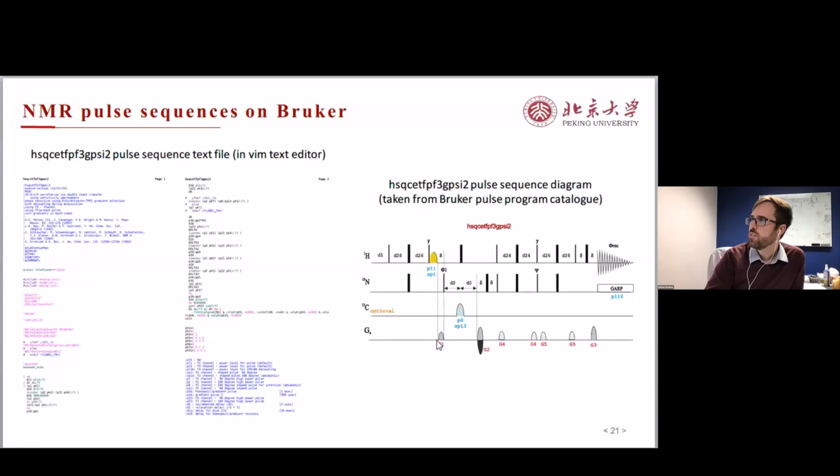All right, and then Barbara saying, many thanks for the nice overview. Little comment: the syntax is changing with the electronics and software versions. The Pulse program manual shown here is a bit outdated. For example, the SPF notation is now deprecated in the most recent versions of Topspin. So I was curious, because I've noticed at times too that the syntax has changed a little bit.